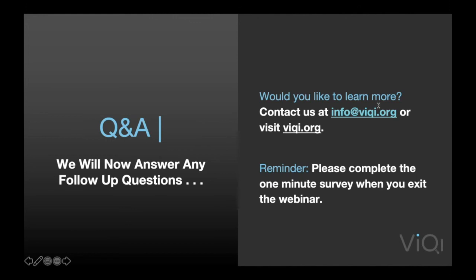And the reason for that is because it has to do with the classifiers. So some classifiers, like if you go from standard statistics, there's the problem of overfitting the data because you've given it too many variables to sort of tune and fit your data very tightly. And so it'll fit your training set really well and then won't be able to predict anything. Well, so that's the statistics kind of approach to this, where you're just doing fitting or regression or whatever.